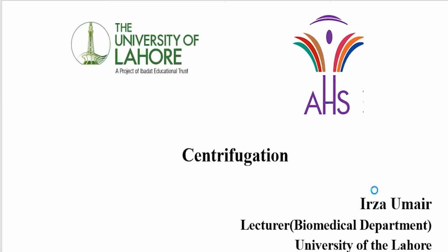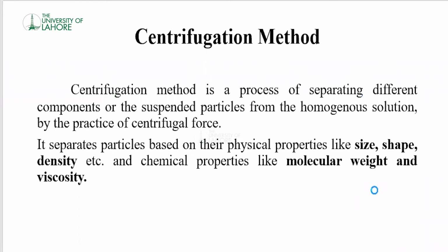Today we are going to discuss what centrifugation is, what a centrifugation machine is, its types, and how it works. The centrifugation method is basically a process of separating different components or suspended particles from a homogeneous solution by the practice of centrifugal force.